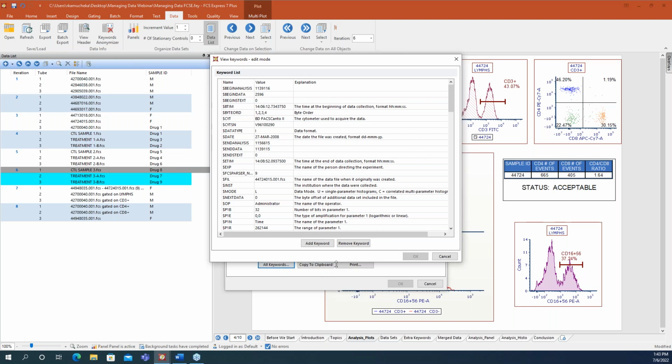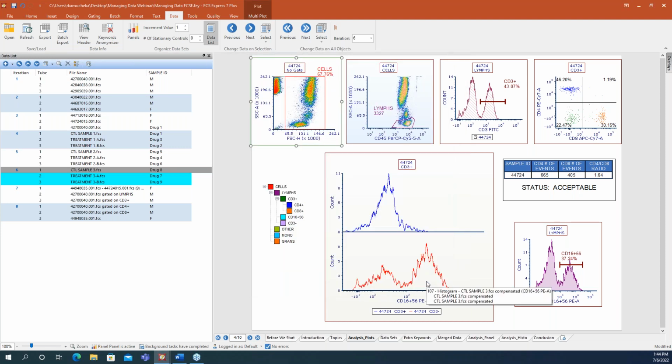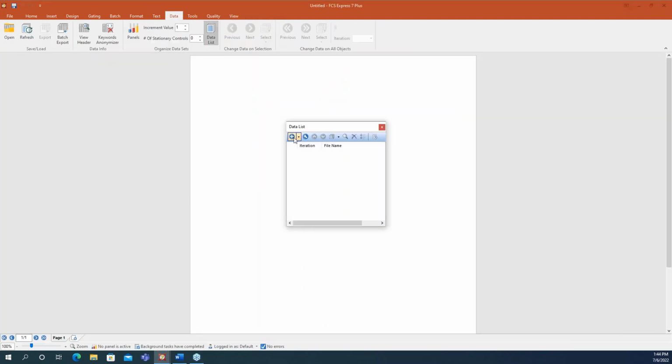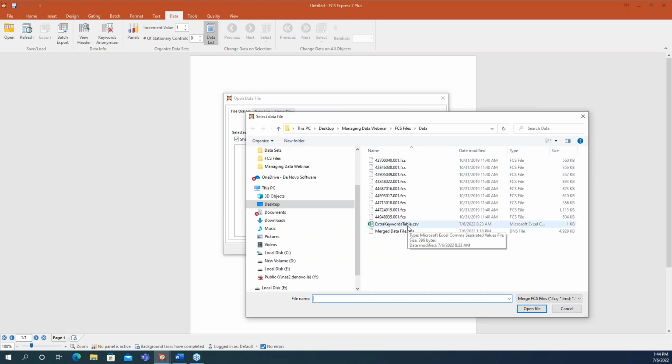I know in our upcoming release, we are going to have some additional functionality for keywords and using them in the workspace. And after you create any of our extra keywords files, you can use them anywhere. So even if I go to a new workspace and add my data files here, any of those keywords that I've already added from this extra keywords table, I can still use as I create something new or different. So it does conserve that. It's just a one-time creation after you've done the extra keywords table.